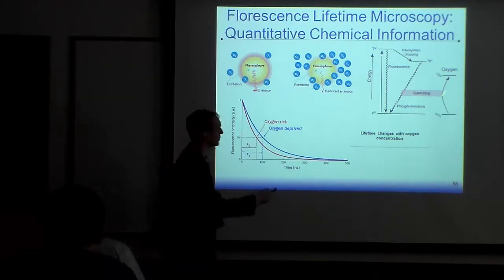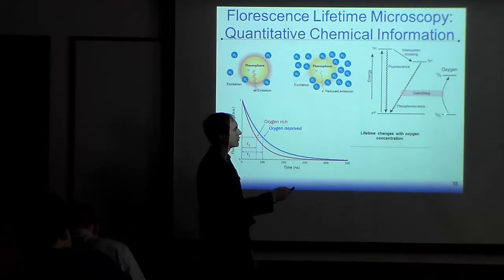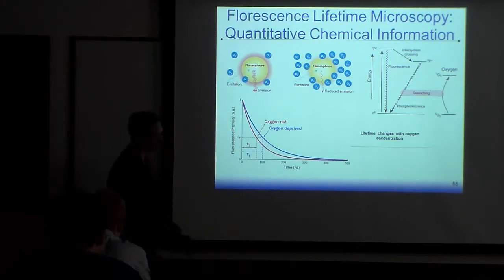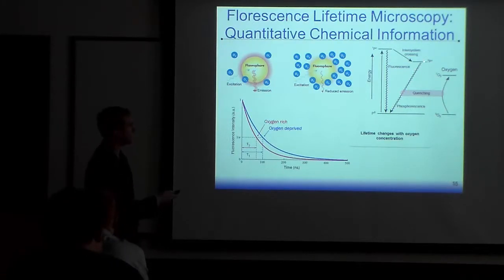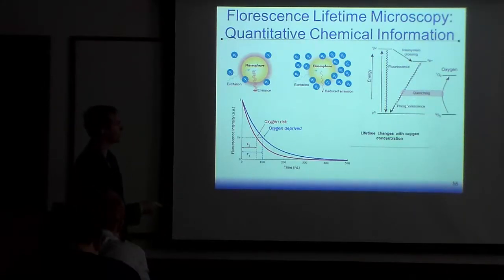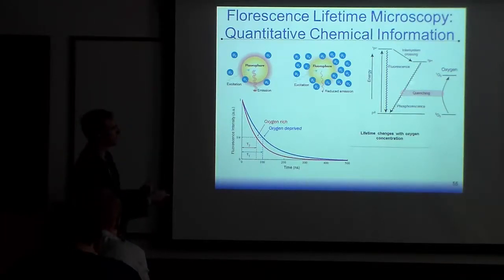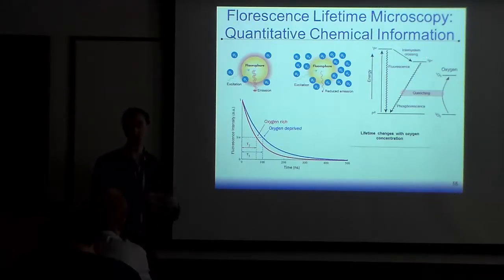And the reason why this happens, basically what's happening is you're exciting a triplet oxygen to singlet oxygen, and this decay path steals this energy through its collisional process. And so the phosphorescence emitted by your fluorophore is going to decrease as the electrons that normally would be in this excited state are now going to be stolen pretty much by the oxygen, and you won't see this. So the two things that will happen is the intensity will go down, and the lifetime of electrons that are present in this excited state also will go down. It will be much faster.